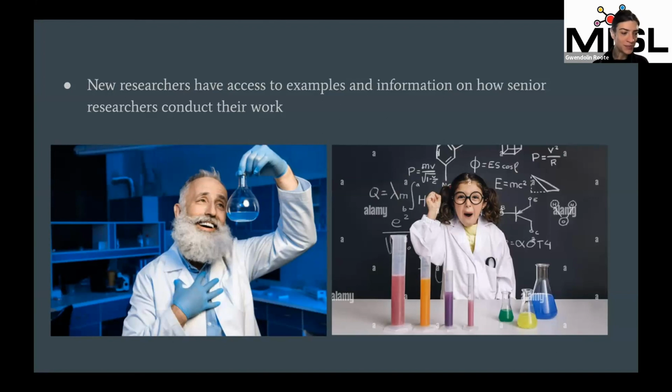I made a whole training on how to use Sample Manager from inside of Sample Manager. So we have an example notebook that students can go into, leave comments on, ask questions. All of our slides are in there, and then you can create an entry that says when you did the training. And I just think it's fantastic. Everything is very contained, and it's really easy to find lots of good information about how research at MISL should be done and is done by the people who've been there for a while.